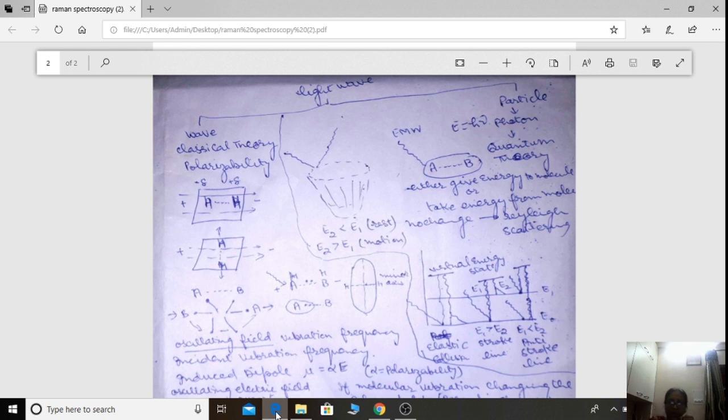See, we can explain it by taking one example. There is one tabla. You see it. There is one molecule. When we strike that molecule with some energy, if it is in the rest form, then this tabla will get energy. It will start vibrating.